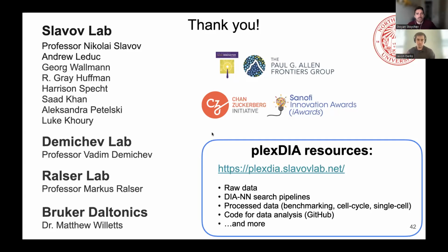And so with really large bulk where you want high coverage, I think that you could probably do a 5-plex or 6-plex, maybe push 10-plex, I don't know, but there are going to be limits at some point. And I want to say again that this is less of an issue for single cell analysis because you're not going to get super deep coverage with that.